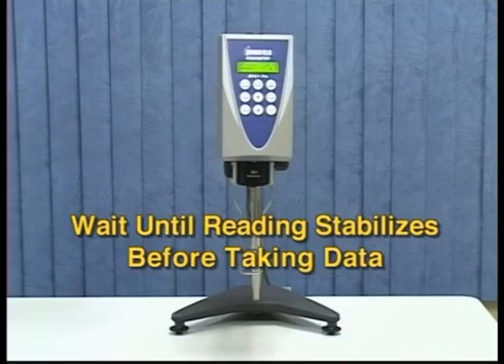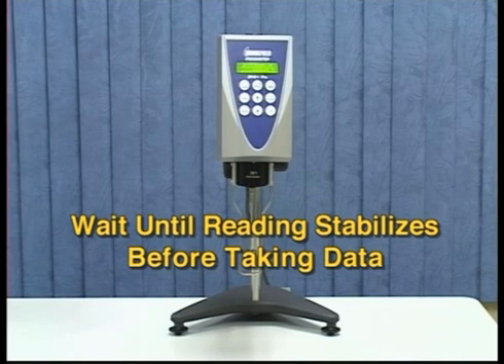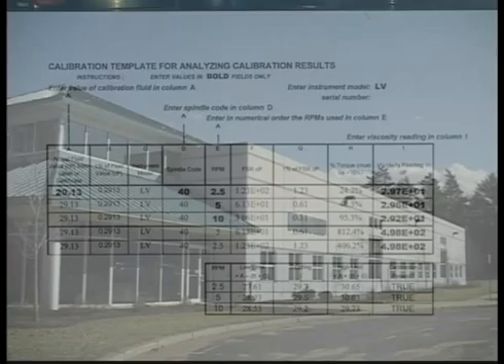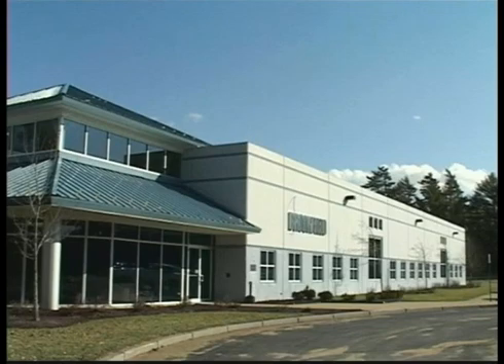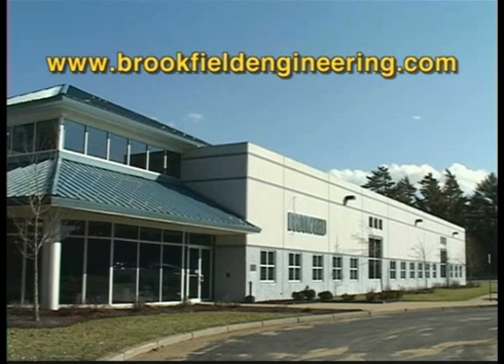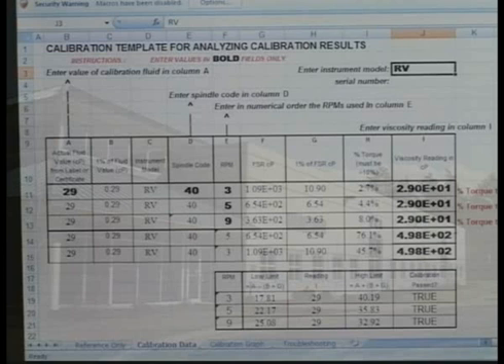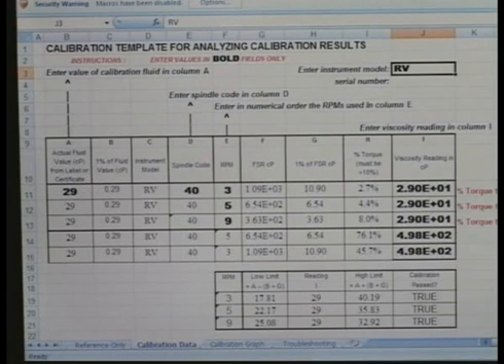You can perform a calibration check manually and enter the values and compute the tolerances for pass-fail criteria. Brookfield supplies a calibration worksheet on our website that easily allows you to enter data, computes the tolerances for each range, and gives pass-fail criteria automatically. You can download the calibration worksheet from Brookfield's website at www.brookfieldengineering.com. Going to the link on your screen will take you directly to the calibration worksheet. To see what these tolerances mean, let's look at this calibration worksheet.